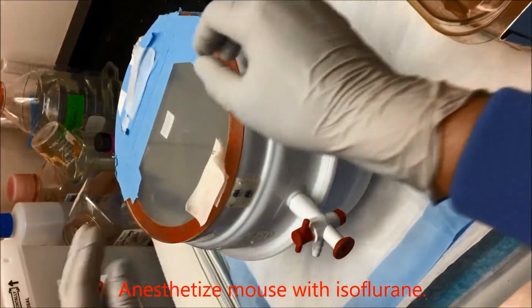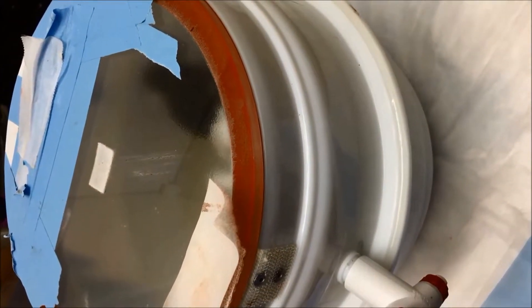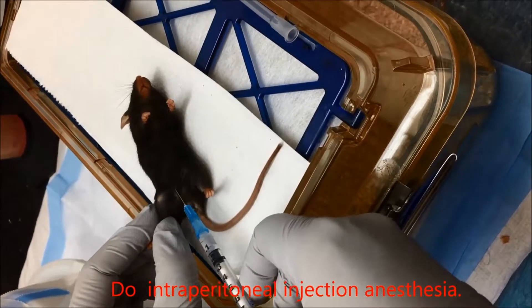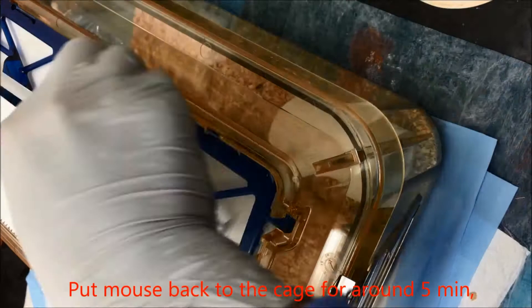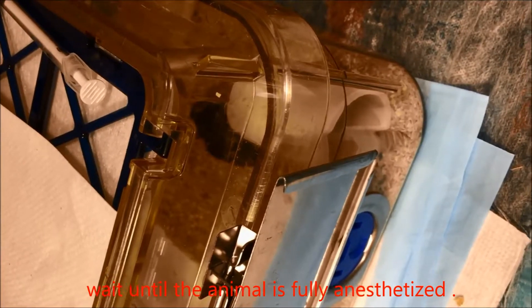Anesthetize the mouse with isoflurane. Do intraperitoneal injection anesthesia. Put the mouse back into the cage for around 5 minutes and wait until the animal is fully anesthetized.